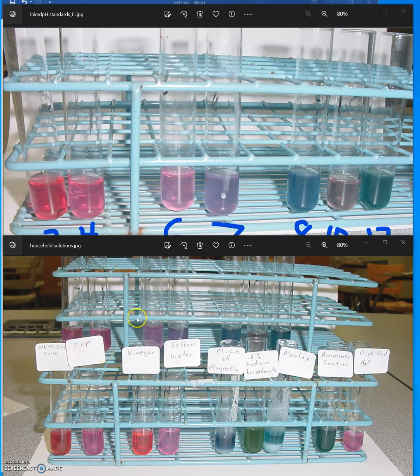So actually in this one photo, these are in the same order. The tubes in the back are kind of up higher. These are the same tubes you're looking at in this previous photo. So you don't actually have to have both images. You can just use this one image. You'll compare the color of the white grape juice to the closest color back here, and you will assign the pH of whatever color it's closest to.